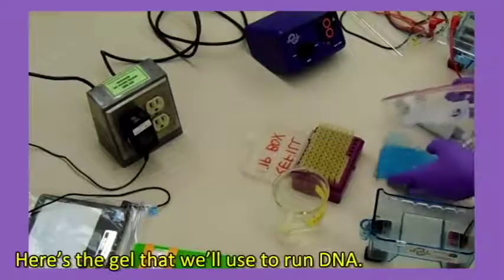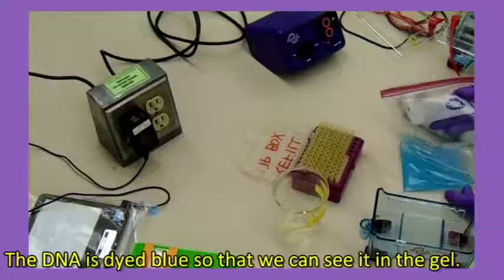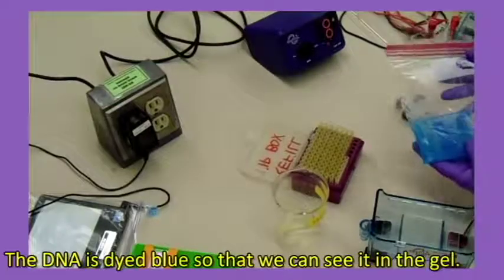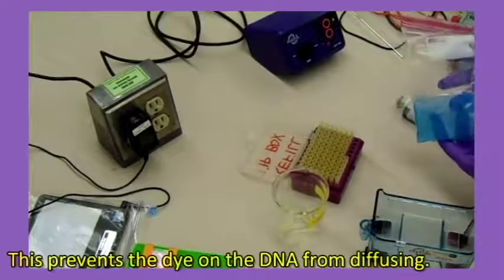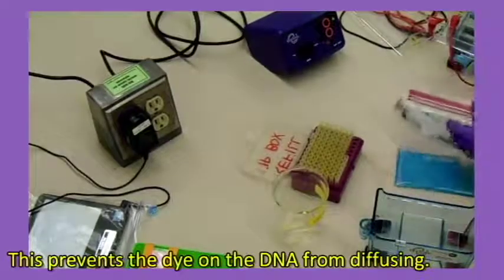Here's the gel that we'll use to run DNA. The DNA is dyed blue so that we can see it in the gel. Both the buffer and the gel are colored with the same dye. This prevents the dye on the DNA from diffusing.